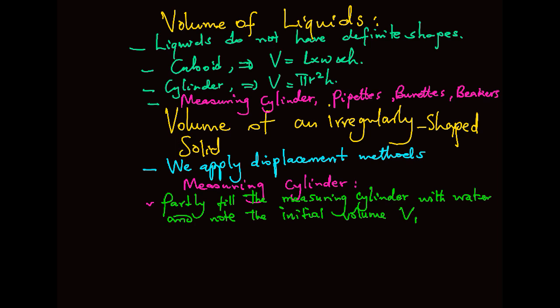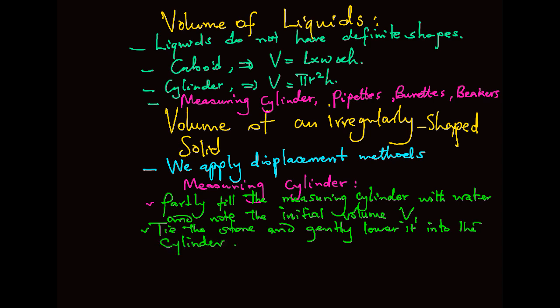If we were to determine the volume of a stone, then we tie the stone and gently lower it into the cylinder, and record the new volume.